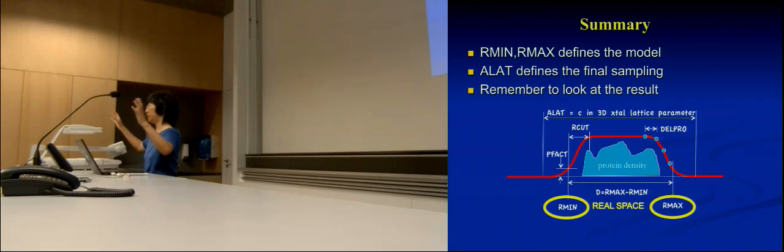Now, if you have enough data, the way the data distribute is going to help you find out if you have a symmetry or not. So, for example, I have a P6 symmetry. Then I actually have P6 symmetry, but I process and merge this as P1.